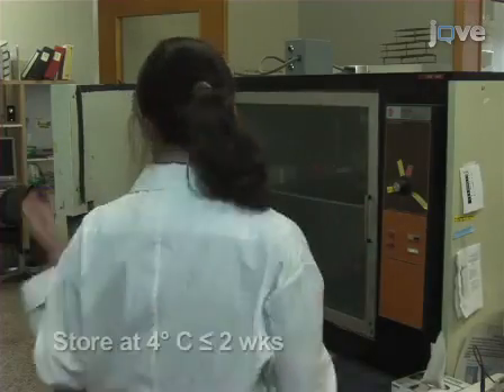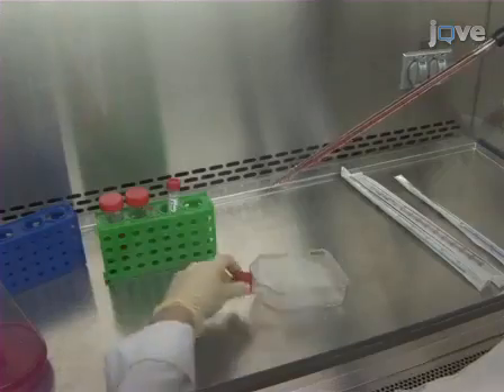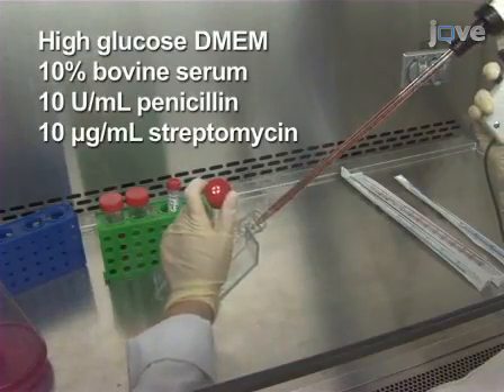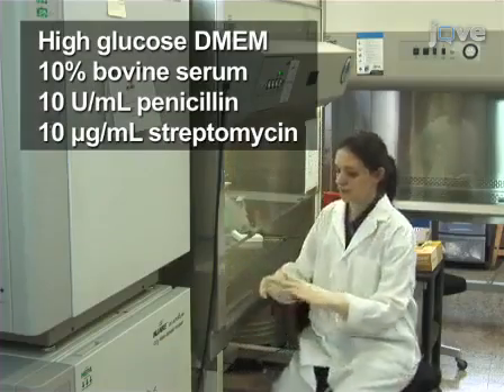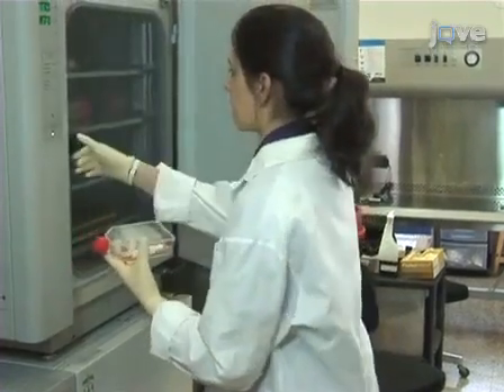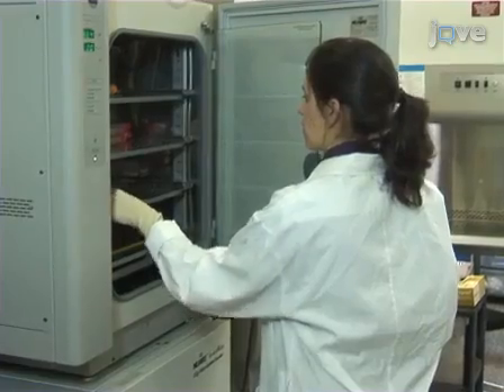Keep the plates sealed at 4 degrees Celsius for no longer than 2 weeks. The mammalian HEP2 cells used in the assay are manipulated under a laminar flow hood and maintained in high-glucose DMEM with 10% heat-inactivated bovine serum, 10 units per milliliter penicillin, and 10 micrograms per milliliter streptomycin at 37 degrees Celsius with 5% carbon dioxide.